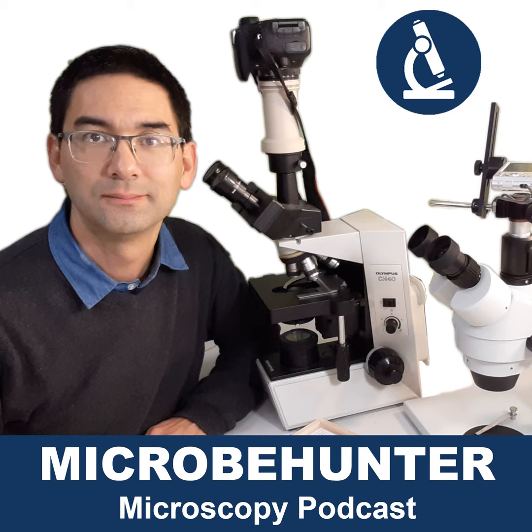We move down to problem number 8. The condenser. Using the condenser for controlling the amount of light. Now, the condenser is an optical system that can be found beneath the stage, and it has several functions, really. Sometimes it also acts as a filter holder. There's a swing out filter holder beneath in the condenser. There is also an iris diaphragm. The iris diaphragm controls the depth of field and contrast and resolution.